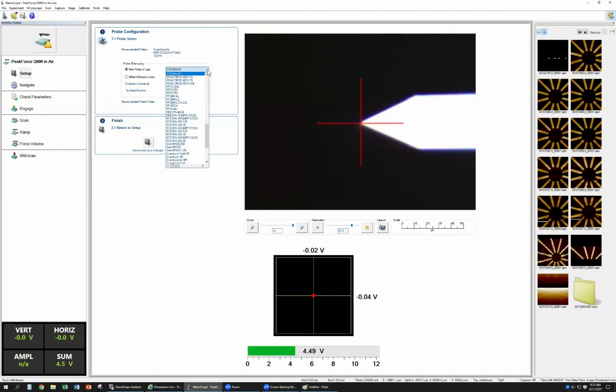That is almost similar to this value, but it's not for accuracy.